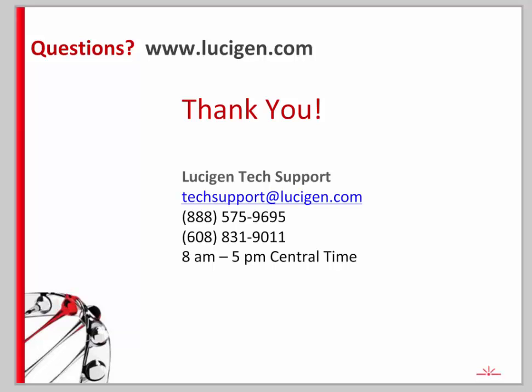Yep, that's a great point, Eric. I do have an application note posted on our website about ClearColi media and some media formulations that work very well for ClearColi. So if you would like to email us, we can send you that link. You can email the techsupport@lucigen.com inbox, or you can check our website. It's listed under the Resources tab on the product page for ClearColi.